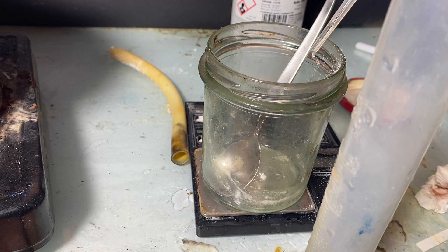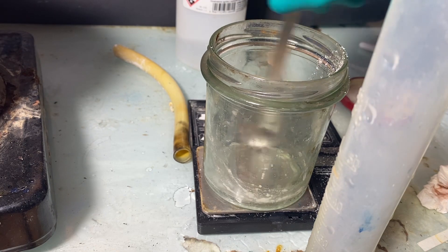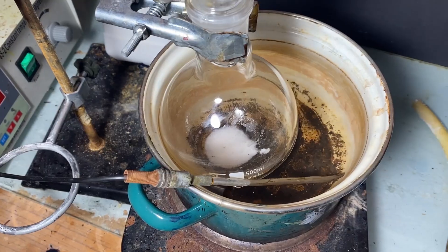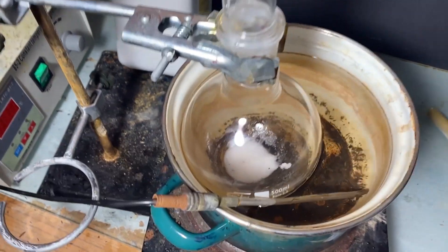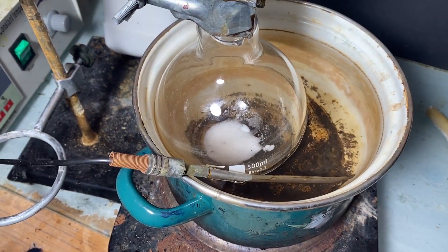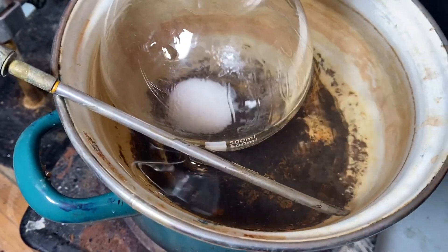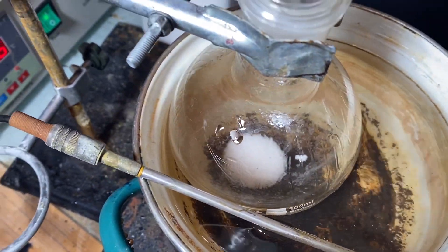I've added some sulfuric acid as a catalyst. We need the 3-to-1 ratio because the reaction we're carrying out is quite water sensitive — water can reverse the esterification reaction, and it's actually produced in the reaction itself. With that, I added the whole thing to the flask and put it into another water bath, carefully monitoring the temperature so it does not exceed 60°C. This reaction should be carried out at around 55°C.